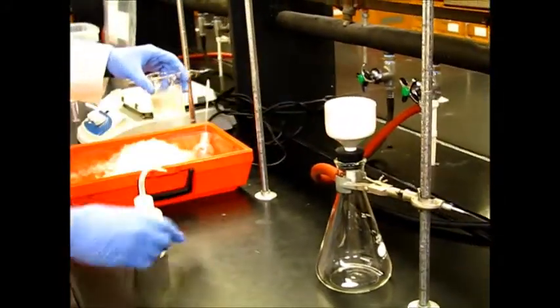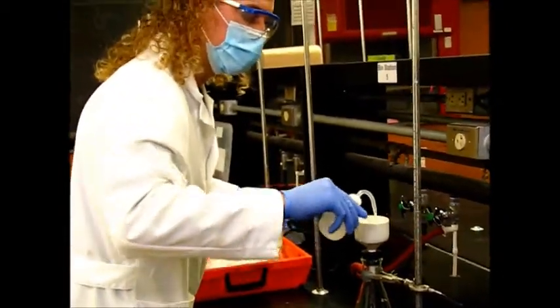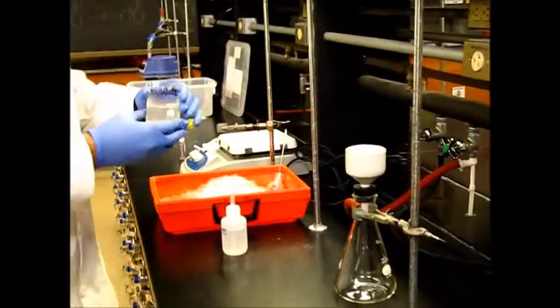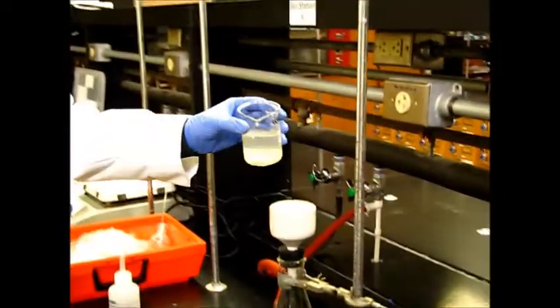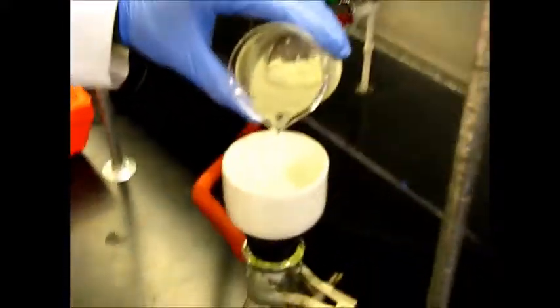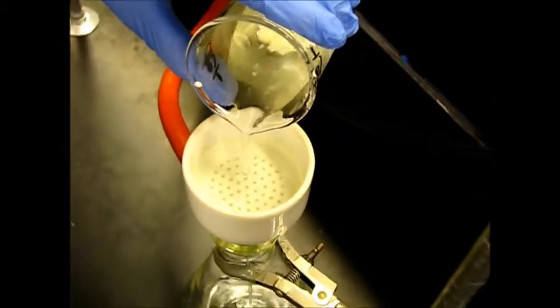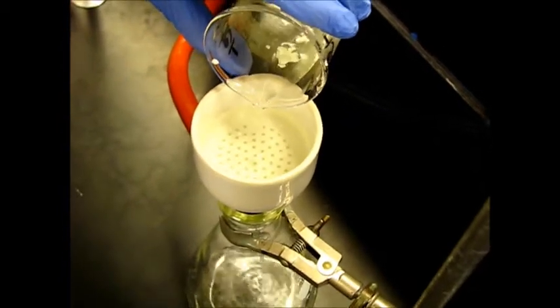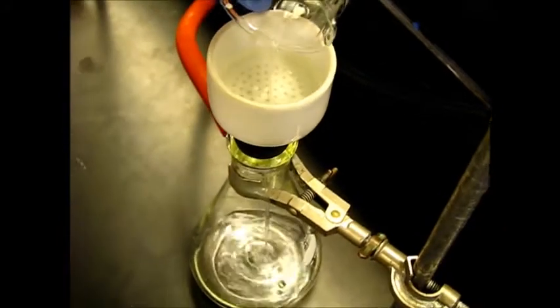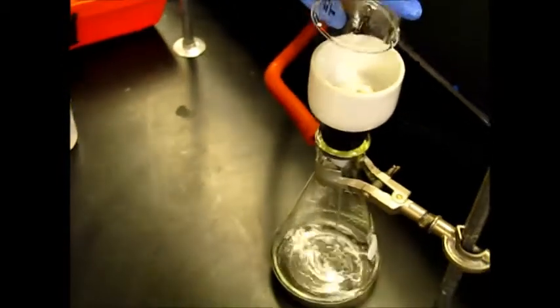Before you start your filtration, you want to make sure that your filter paper is wet so that you don't get any solid underneath it. Then we're going to add this whole thing in here. We're separating the water from our solid, which is our product.